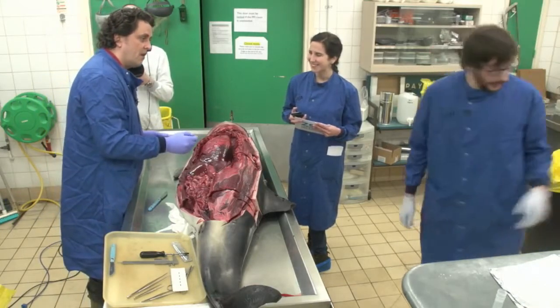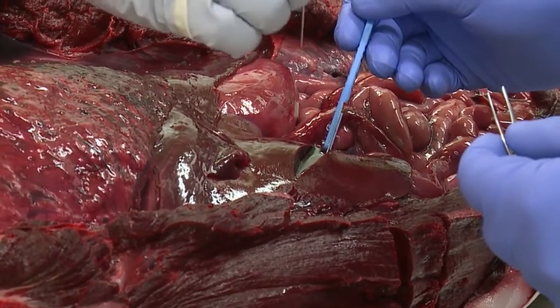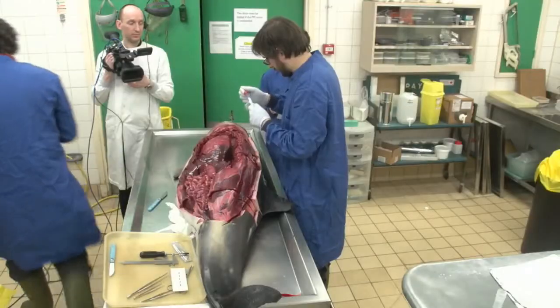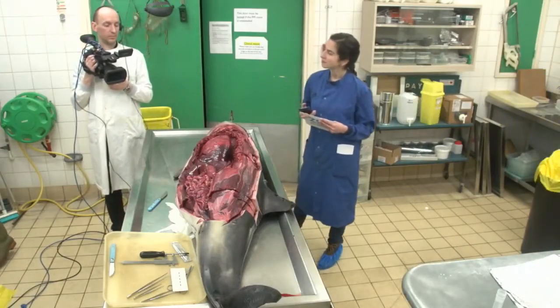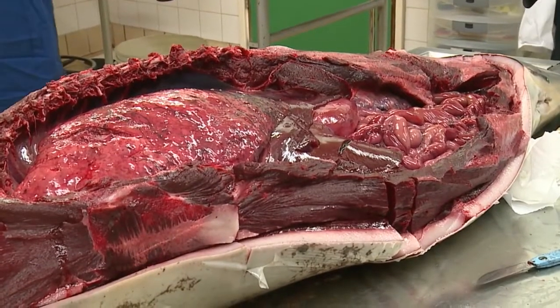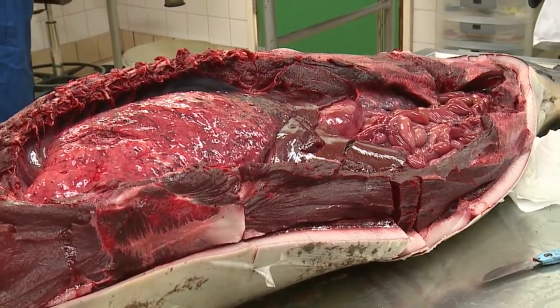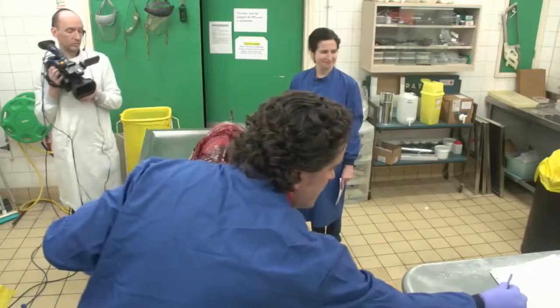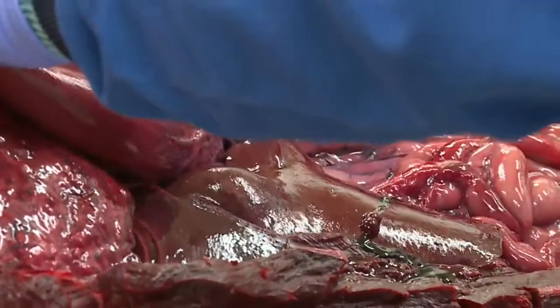And then liver. Yes, please. Great, thanks, Matt. As I've opened the liver up there, hopefully the camera will show this welling of blood that's coming out. This general picture of congestion, or a lot of blood in the carcass, is something you commonly see in bycatch animals. Okay, last sample. Here's the spleen. I'll just take these, it's fine.